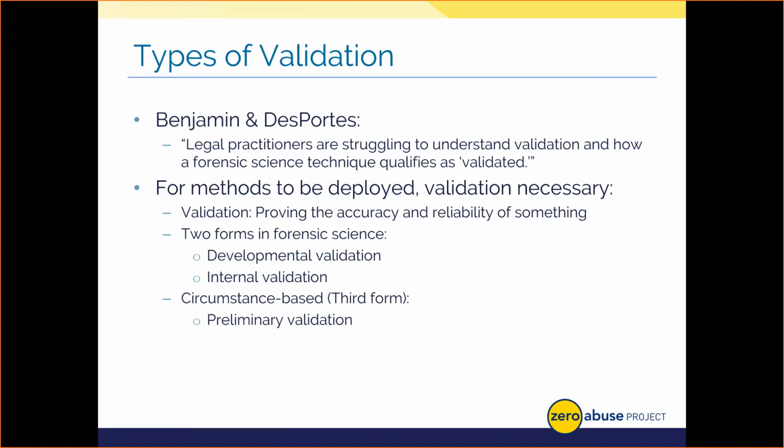Internal validation is something we do at the lab. Once we acquire a new tool or we decide to adopt a new testing method, we perform a battery of tests in the lab and create an abundance of testing data to demonstrate our methods and how far the laboratory can perform a given analysis and its success thereof. So internal validation, every analyst should ideally be doing this in your labs. That is somebody basically testing and showing you what the forensic laboratory actually can do.